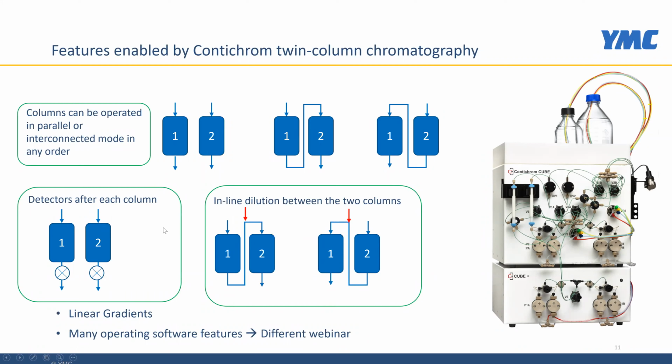Okay, so as mentioned, this has been shown in other webinars. The wizards have been presented there in detail. So now I would like to move on to specific features of the ChromIQ software that make it easy to run continuous chromatography. So we've talked about the design of the process now. Now we will talk about how to run those processes.